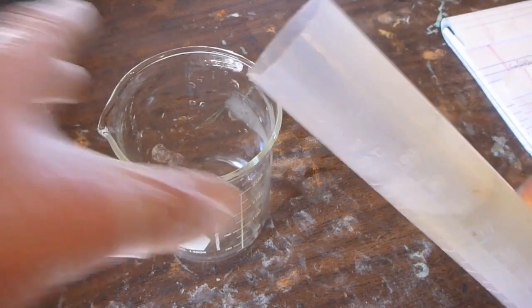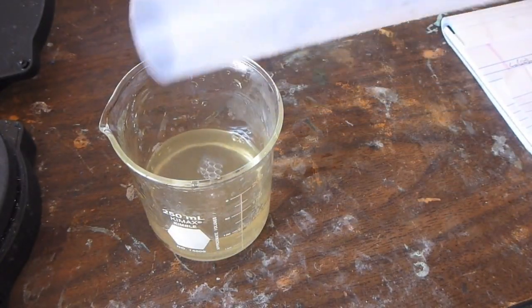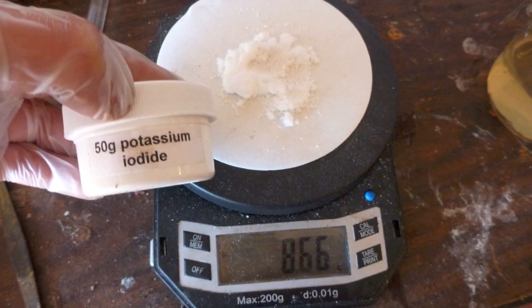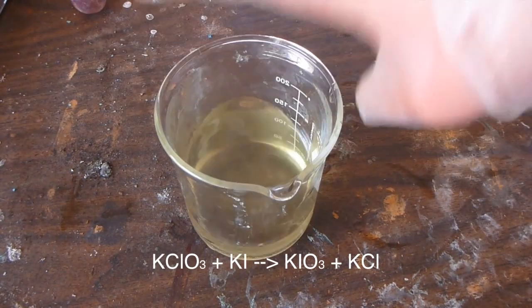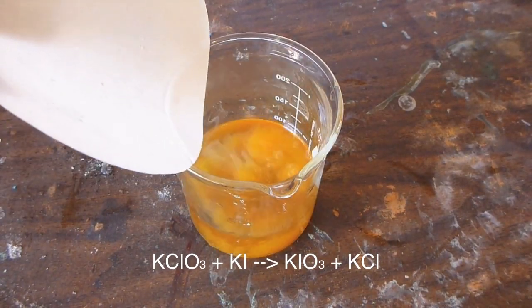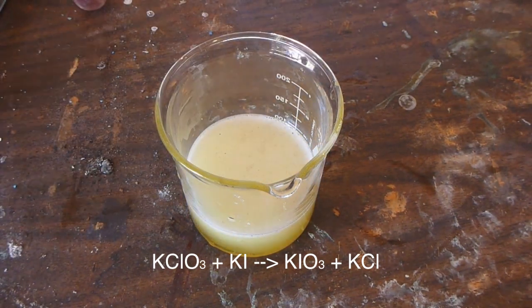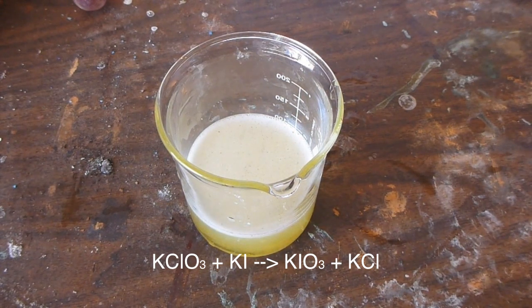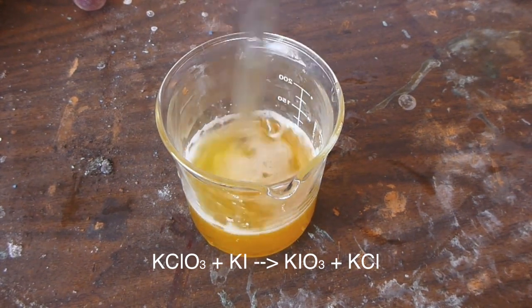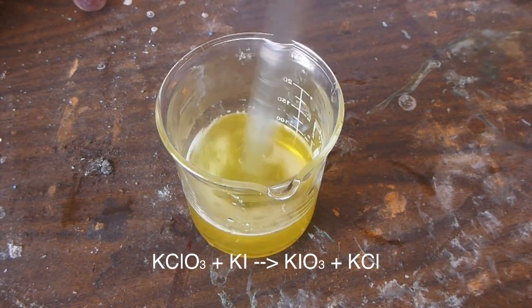Now take the solution you got and pour it into a beaker. Now weigh out 8.66 grams of potassium iodide and add it to the solution. You'll see the solution slightly yellowish at first because of dissolved chlorine, but it gets quite a bit redder, and then as you stir, it'll get lighter again. I believe this is because of some elemental iodine in solution, which then immediately gets taken up again into iodate. So now you've created potassium iodate.